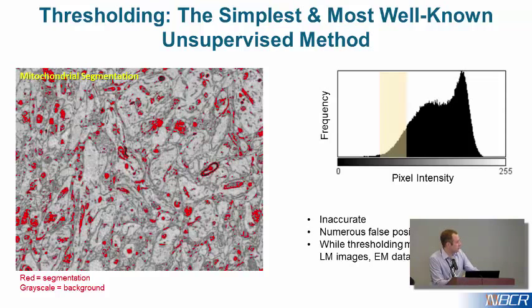So as you can see, by flipping between these here, for example, those are 3 mitochondria. You can see it got a couple of them really well. It did one really poorly, but probably the biggest issue is all of the false positives we have here. So things that aren't mitochondria that were actually marked as mitochondria.